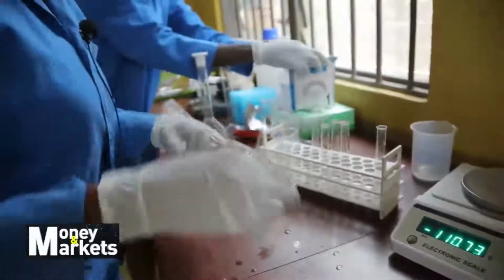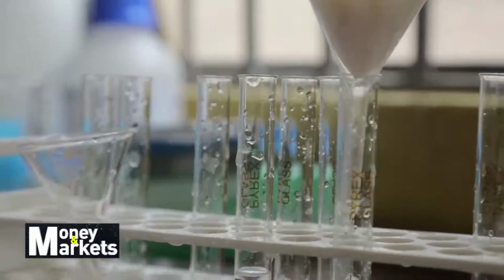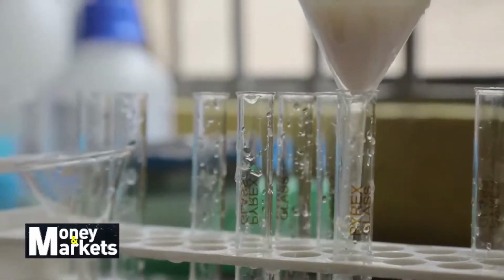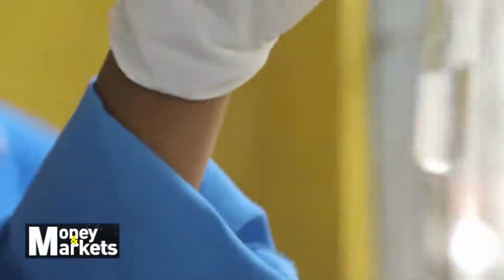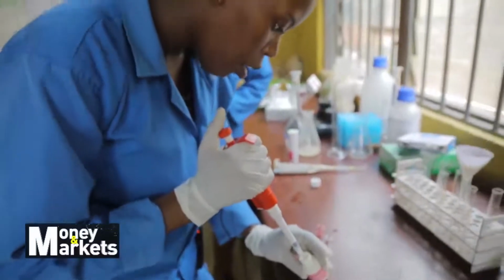You filter your sample using the filter paper. After filtering the sample, you get your filtered sample, which you can see is very clear. Are you seeing it's very clear? Very, very clear. Yeah.